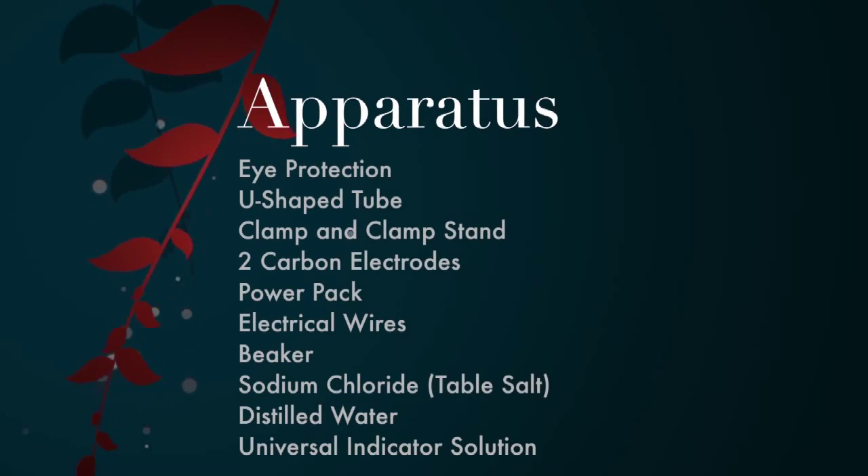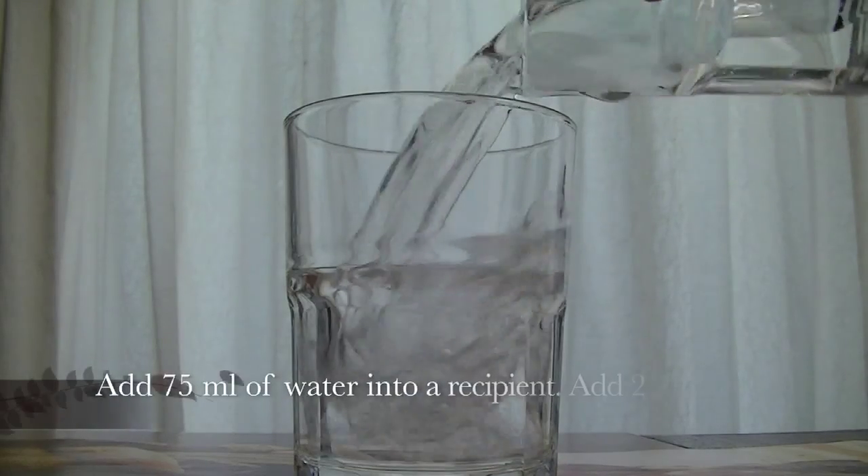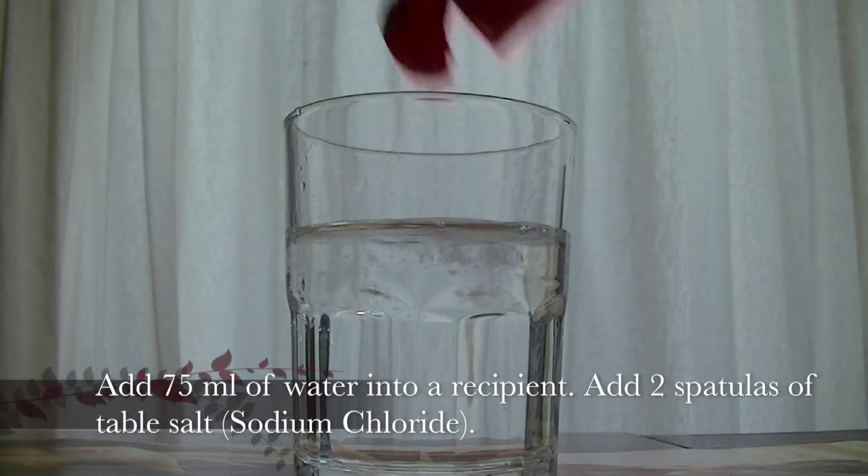You will need eye protection, a U-tube, clamp and clamp stand, two carbon electrodes, a power pack, electrical wires, a beaker, sodium chloride, distilled water, and universal indicator. Add 75 ml of water into a recipient.